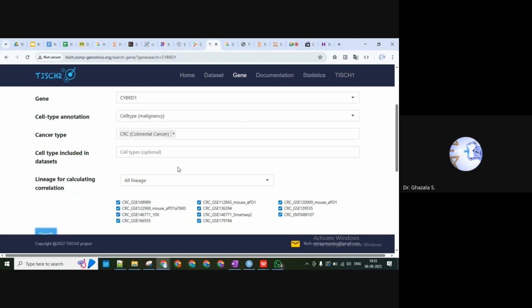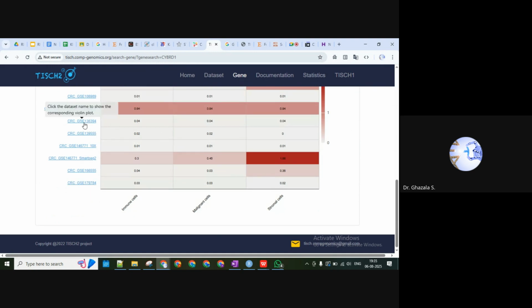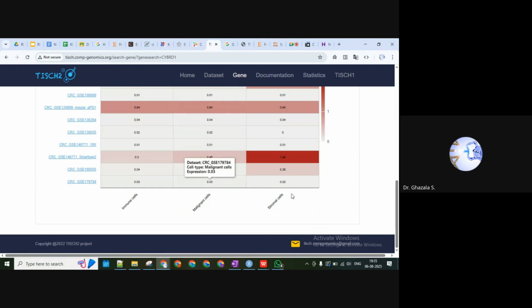Okay, so now what we have done is we need to check the cell type annotation. Earlier it was about major lineage and minor lineage, but right now we mention malignancy, that is for tumor, and it is mapping our gene with different types of data sets. The information is derived from that: within immune cells your gene is active, and within different malignant cells, wherever a tumor is there, it will be active, and then stromal cells. So all these cell types will be considered within tumor microenvironments.